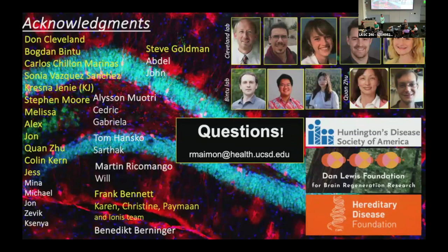So I guess the question I had was whether you can elaborate on where the enhanced sensitivity is coming from, and how the higher performance, to the extent it is affected, does it impact? Because I know with a lot of these assays, especially the commercial ones, at least talking to some of the scientists there, there seems to be this Goldilocks zone they're trying to keep on a per transcript level so that they don't get spot coalescence to confound the IDs.